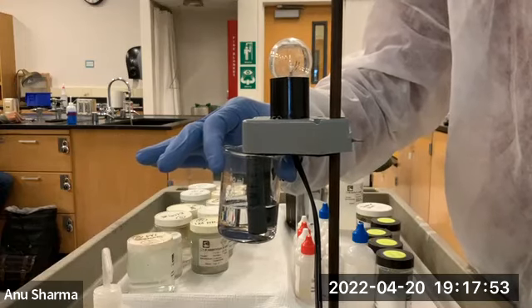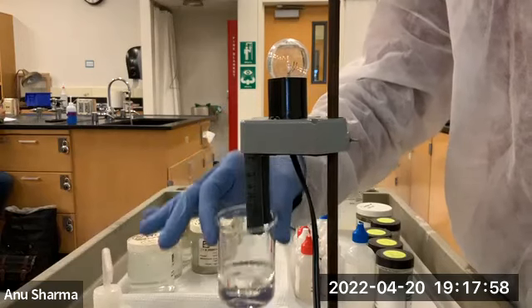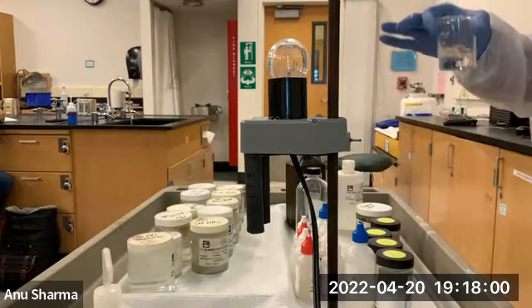It is not released as an ion. Therefore, we need ions for electricity to be conducted, okay?